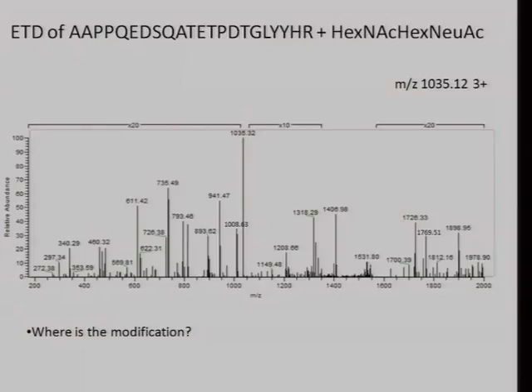If we have all those results, then we can build a model with all those results. So you want a summary of all the identifications that we got in the whole data set? Yes.